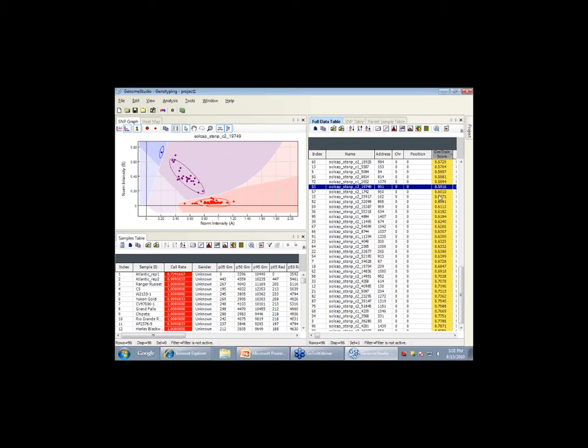So the question is, if you're testing a wild species for a particular SNP, are you likely to detect this? The answer is we do actually have quite a few species here. We did this data set with a bunch of diploid species, and we did get good data from that. So that's the same question that we had in the previous seminar. If I design a set of primers in the DM, can I get it in the others? And the answer was yes. For what we've seen, the answer is yes. You may get some that fall out if they're too broad, but that'll show up as missing data points.